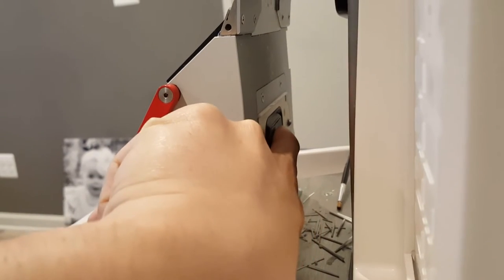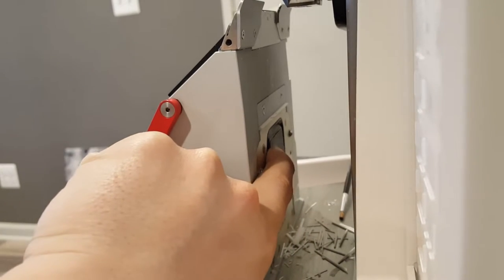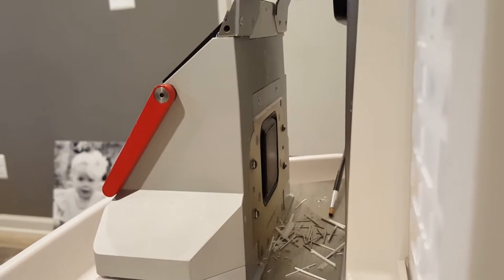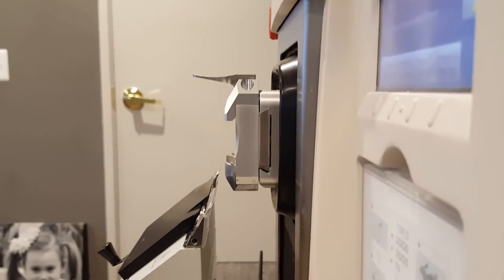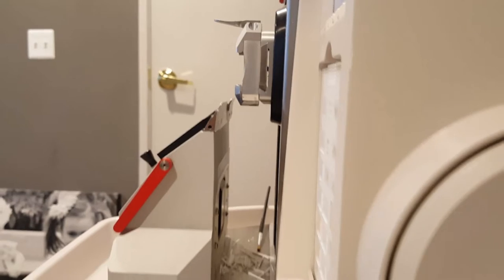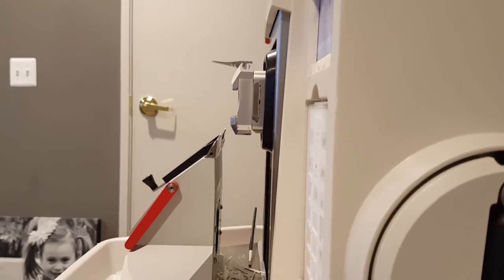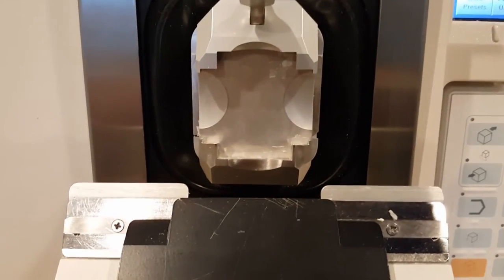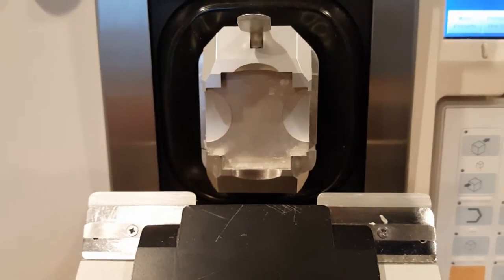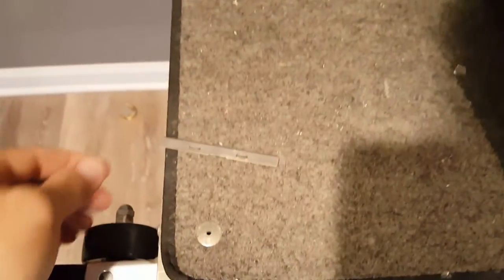This thing back here — this is what's so cool about this microtome. This is what's going to sense or measure where the face of the block is, and it will orient the objective head to the face of the block. It will automatically face your block for you, and it will trim and section automatically, unlike some of the other automatic microtomes where you have to bring the face of the block up to the cutting edge of the blade. But this, it will automatically do it for you.